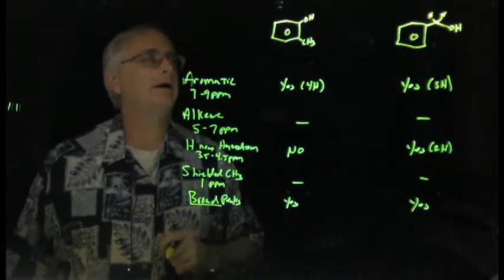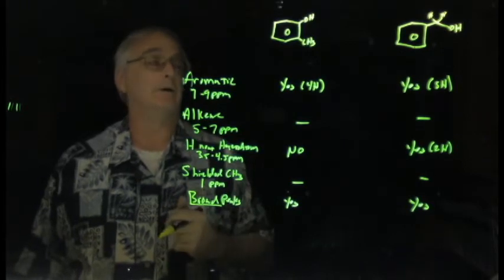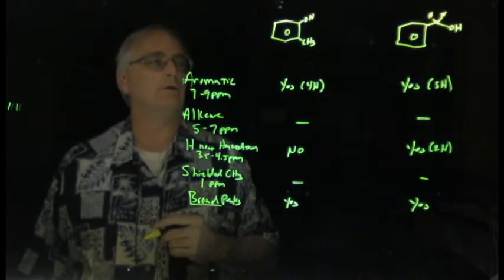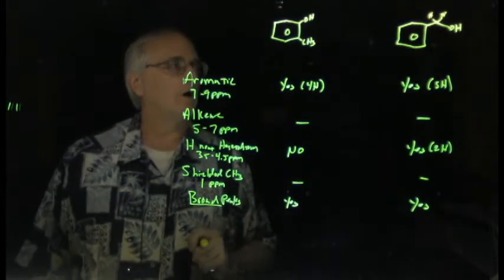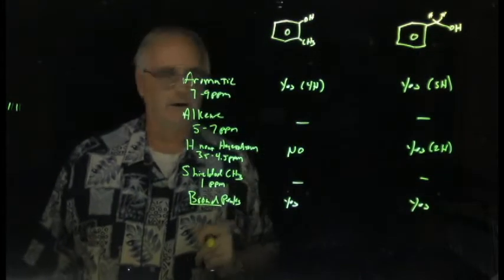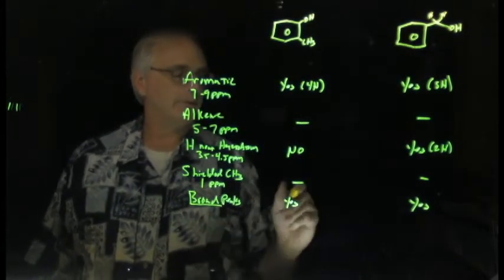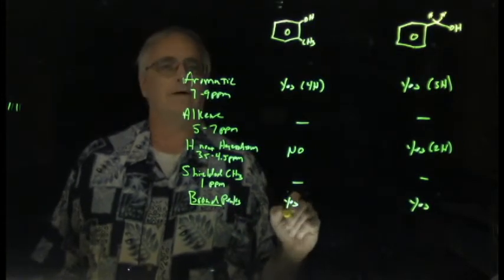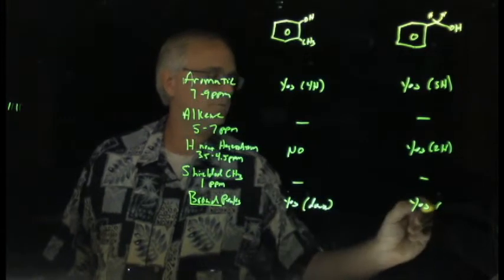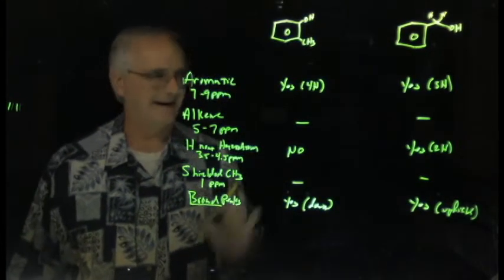This is a hydrogen on an oxygen as a part of an aromatic ring. It's part of a phenol. That is going to generally be pretty de-shielded compared to an alcohol like this one here, which is at the end of a little chain of carbon attached to a carbon here. And so this one will be downfield, far on the left side of the spectrum. And this one will be more upfield, okay? Middle to right side of the spectrum.